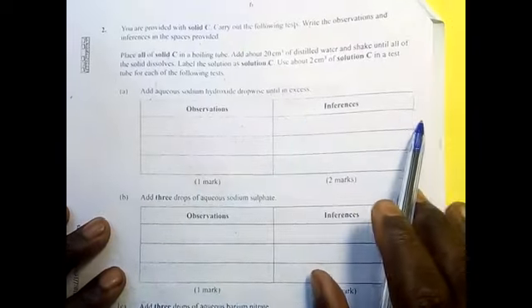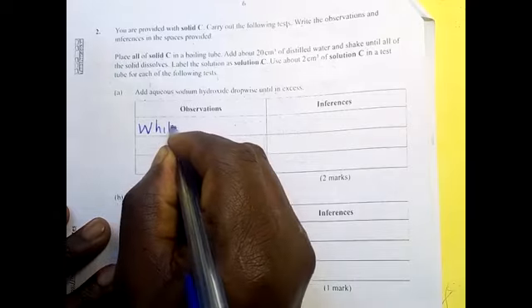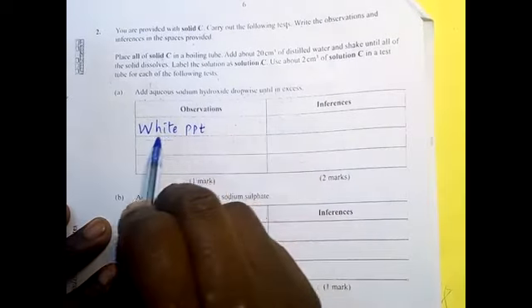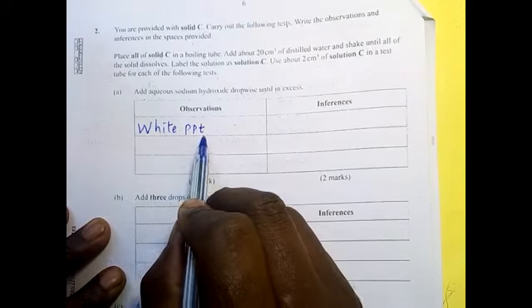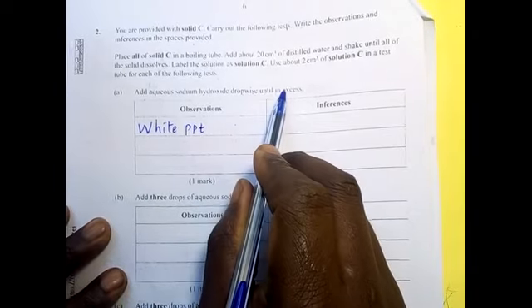So this is what was observed. A white PPT. This is the first observation: when you put a drop, a white precipitate is formed. Then what happens to the white precipitate when sodium hydroxide is added in excess?